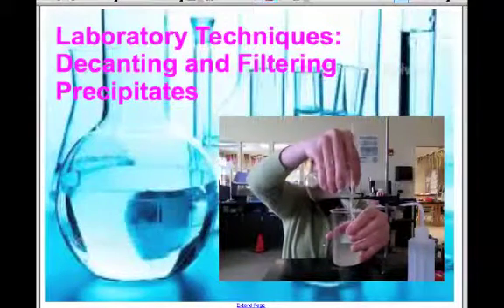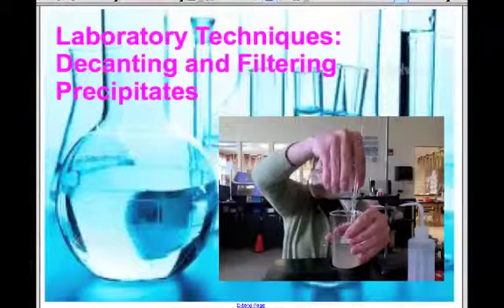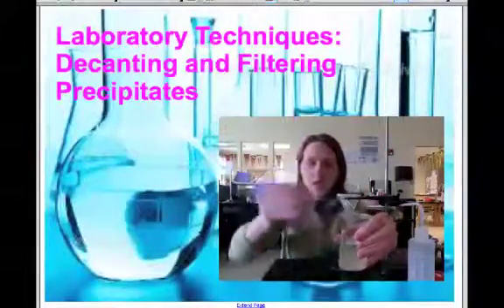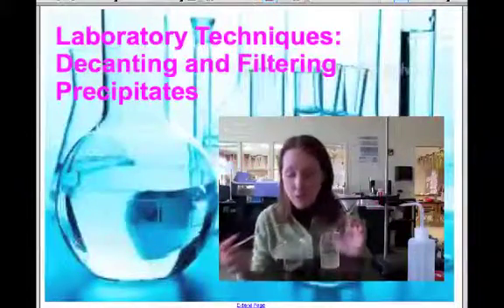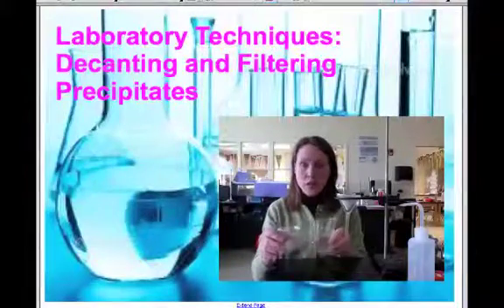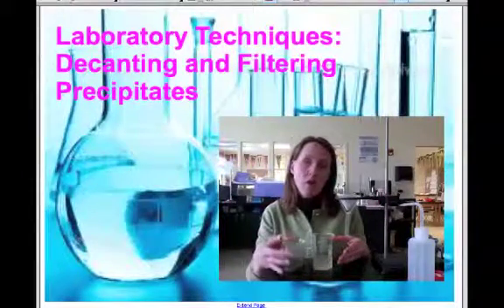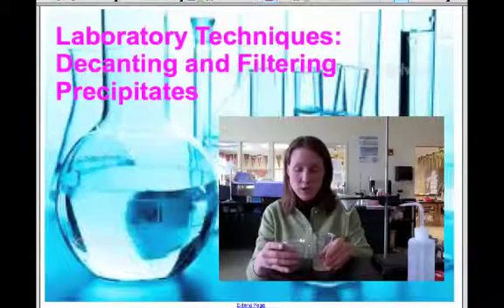And you will also notice when we are finished here that this is not a completely thorough process. I'm getting rid of the bulk of the water, but I obviously still have pretty wet precipitate. So this is not a completely thorough, complete process. We still have more work to do if we want to remove all of the liquid from our precipitate. But decanting removes the vast majority of it.